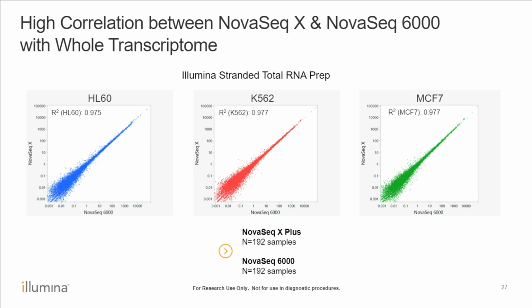Some of them have projects that you can run through and compare to your pipeline. But on there, we have even more. We have a ZymoSeq methylation, we have a 10X library, and then a lot of the standard whole genome, whole exome, bulk RNA, mRNA, and those types of things.